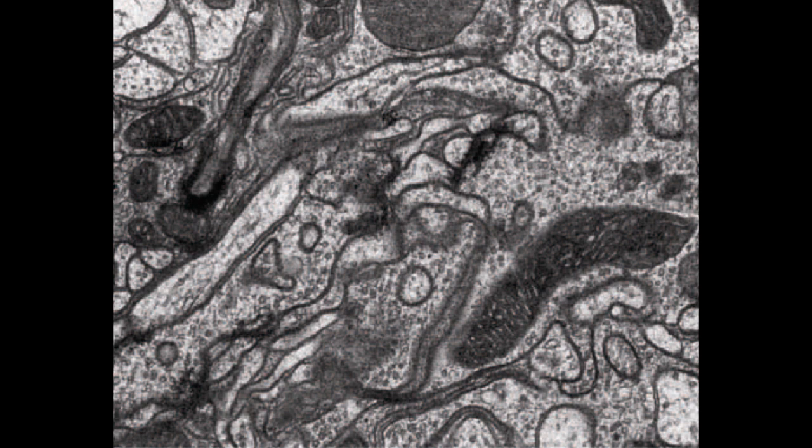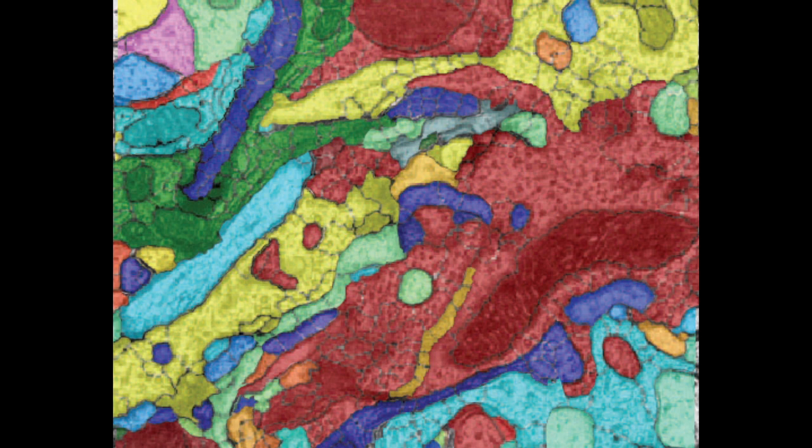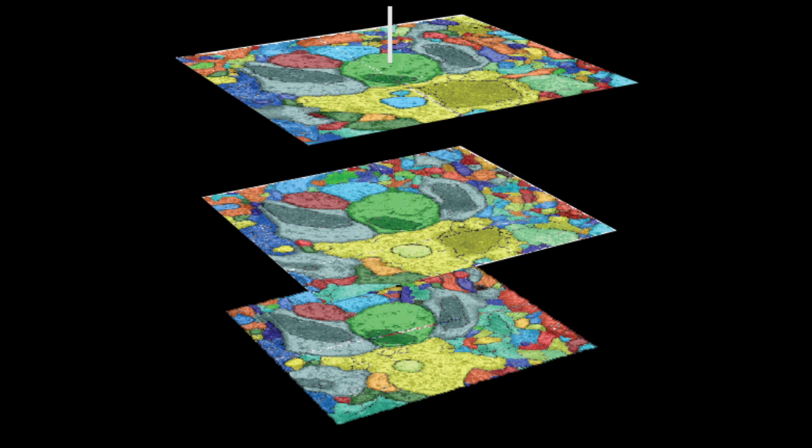microscope. Next, the individual images are precisely colored based on the researcher's determination of the cell bodies and axonal and dendritic profiles of individual neurons. A computer program then stacks the images and matches the colors, which correspond to the individual neuron profiles, with lots of manual proofreading to ensure the accuracy.